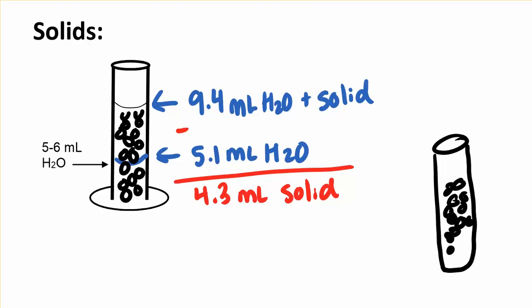Some of the tubes have less. On the real dense ones we don't give you as much, but there's enough to do 2 trials and maybe more. So only use half for each trial or less, and then that way for the second trial you'll have some solid that's already dry. Another thing, make sure that you don't let the liquid go over the 10 milliliter mark.